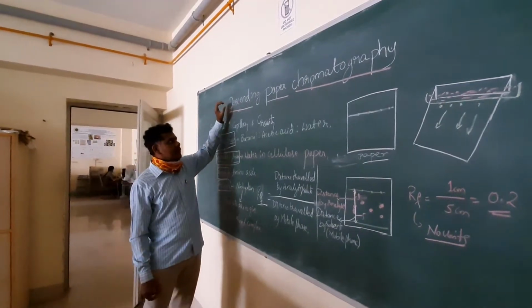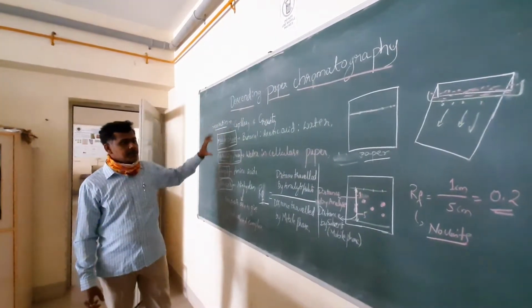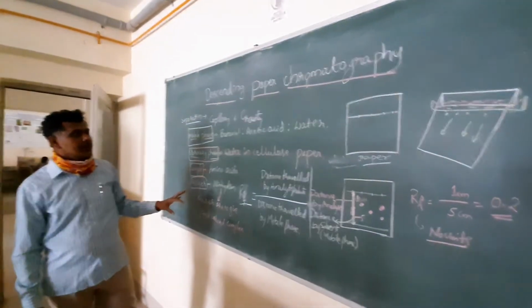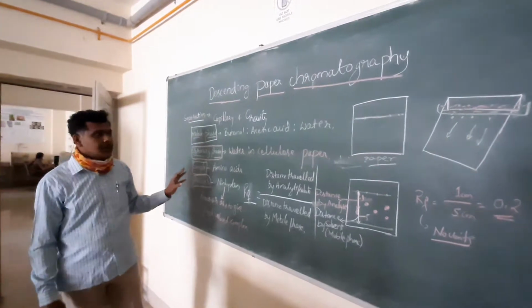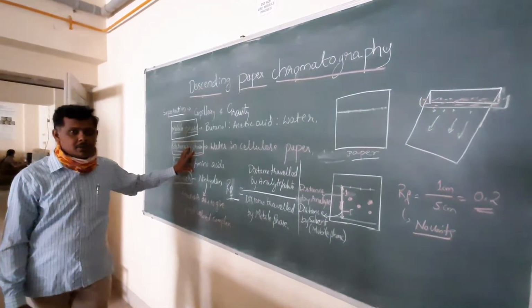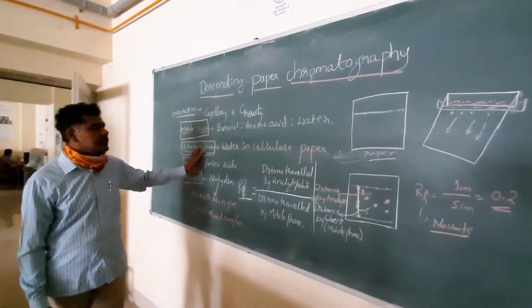Hello students, today I will be explaining the principle of descending chromatography, and we are going to perform the experiment. Because of this lockdown, I am sending you the video so that it will be helpful for you to understand and to do the experiment.